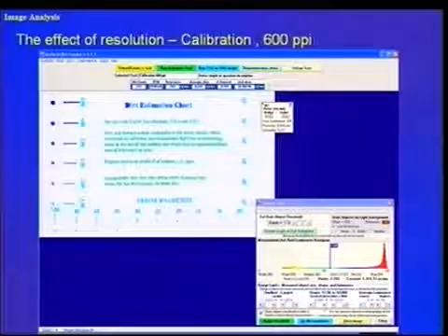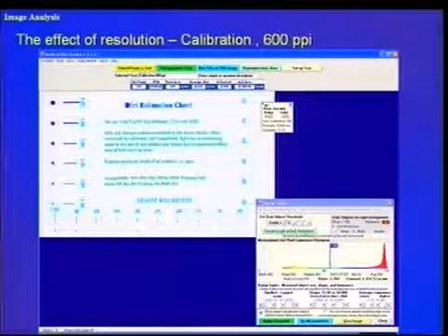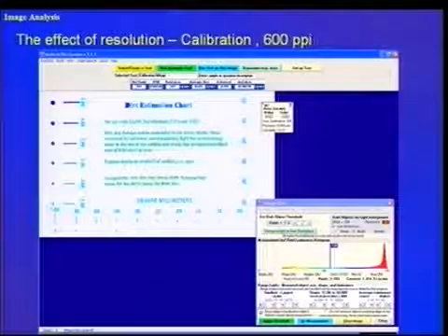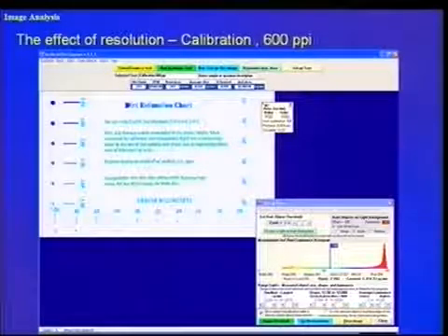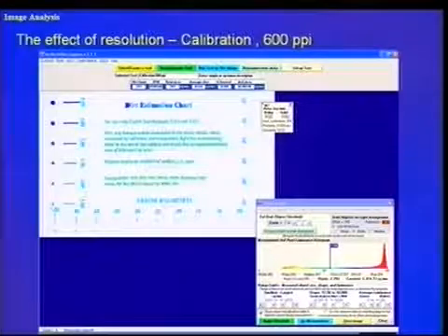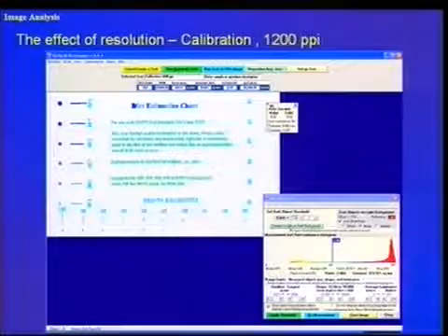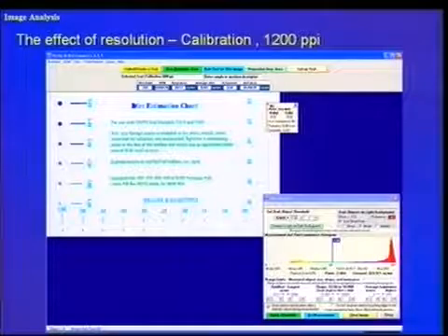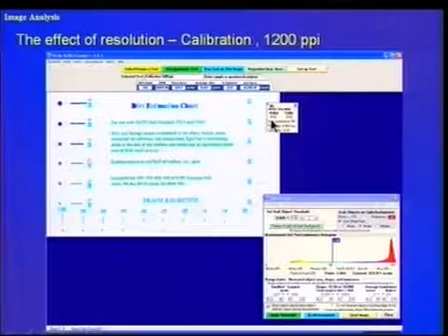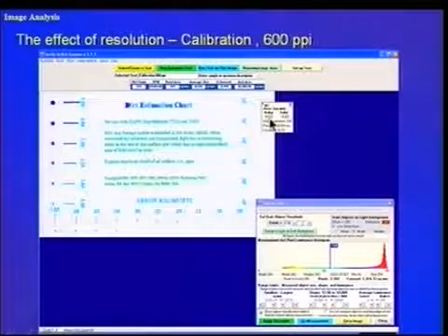It's perfectly white, and the speck is standing right out on the surface. If we do this, we can get a very good measurement of the dot. This means that the scanner is working well. Everything is tuned up very nicely. At 1200 ppi, you see that we get a much finer resolution of the 0.02 dot, and its actual measurement is 0.02, whereas in the previous example at 600 ppi, it was 0.022.